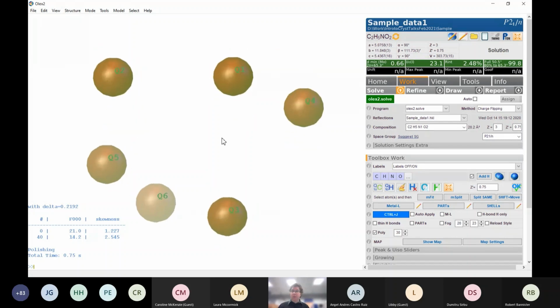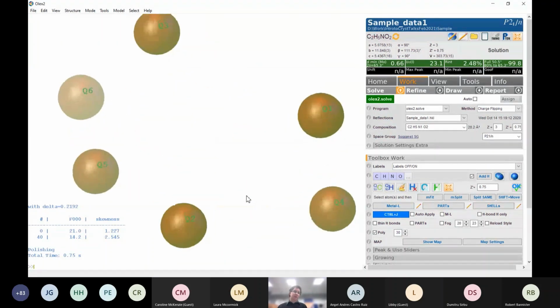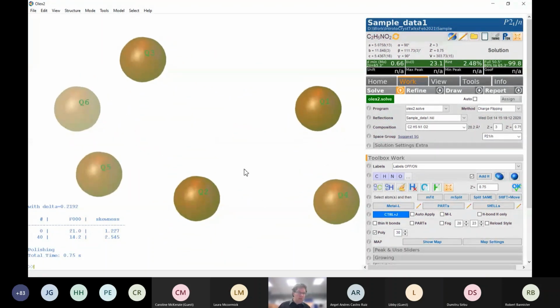So one of the best buttons on the program is this one up in the top right, where there is a circle with 4 arrows. Generally, you click on it and hopefully things move close together. In this case, they're not that bad.